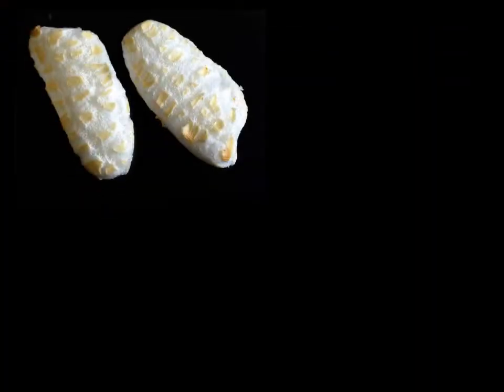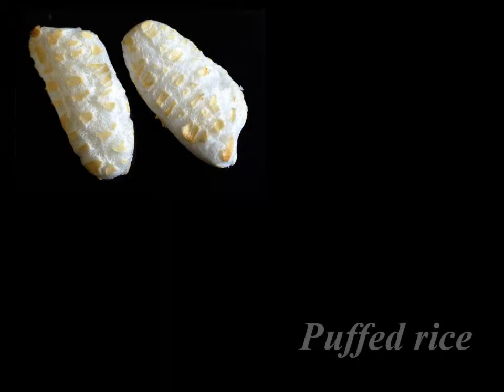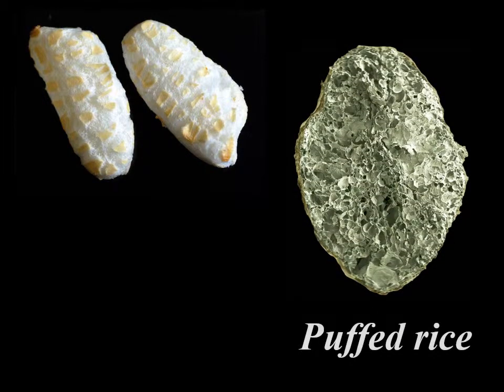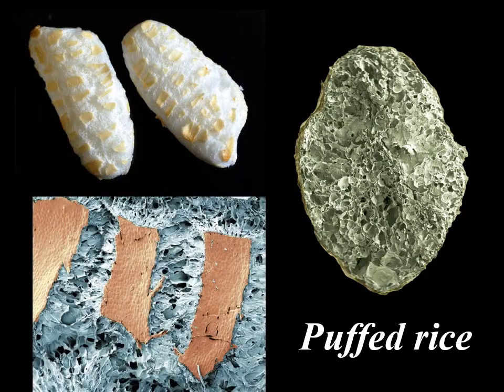Similar to popcorn, puffed rice is made from rice grains expanded quickly by the conversion of their moisture content into water vapor. The puffed grains have a foam-like internal structure consisting of small air cells. When a grain expands by the developing steam, its seed coat breaks into small fragments like tiles which float on the puffed grain. Unlike popcorn, rice grains do not contain enough moisture to be successfully popped at home. Rice is therefore processed in industrial settings at high pressure with steam. A sudden release of the pressure ensures that the grains do not disintegrate but become fluffy.